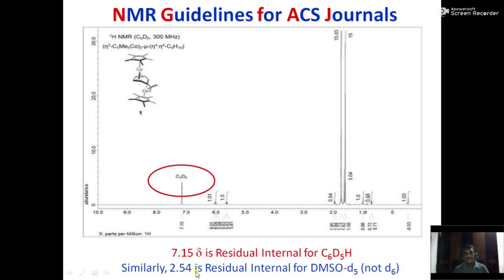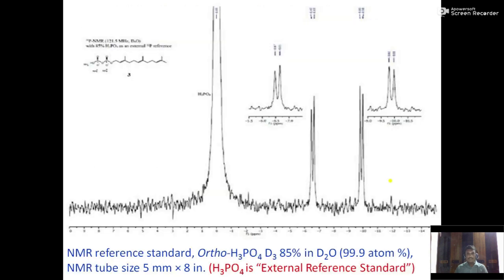You can use that peak as an internal standard, and you don't have to add TMS additionally. Tetramethylsilane, there is no need to use tetramethylsilane again. Next slide we will see.